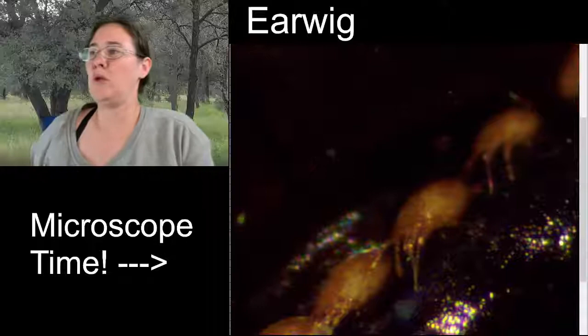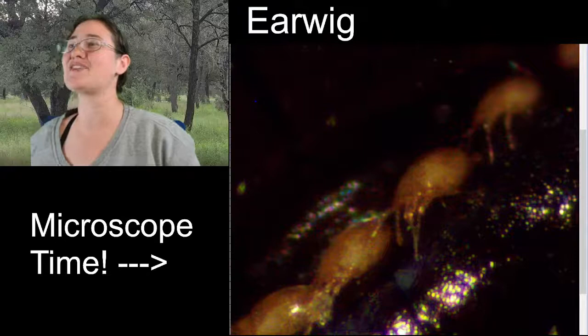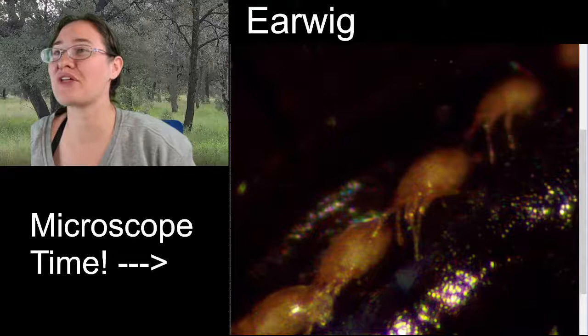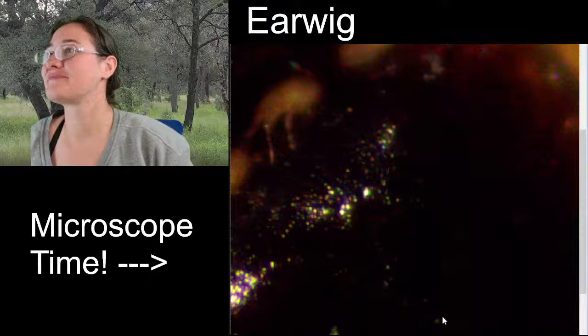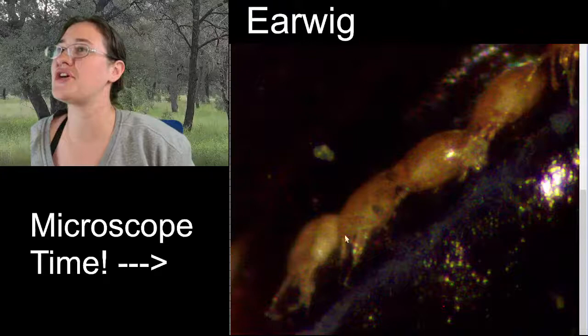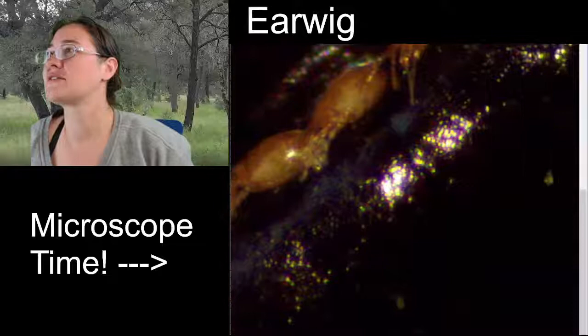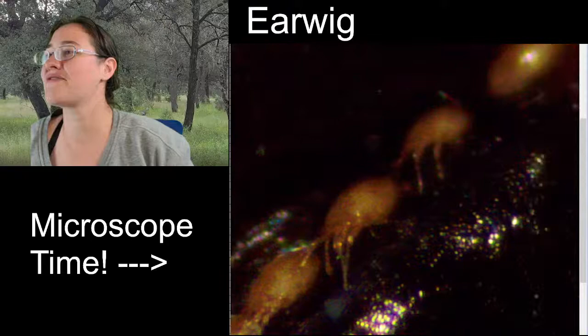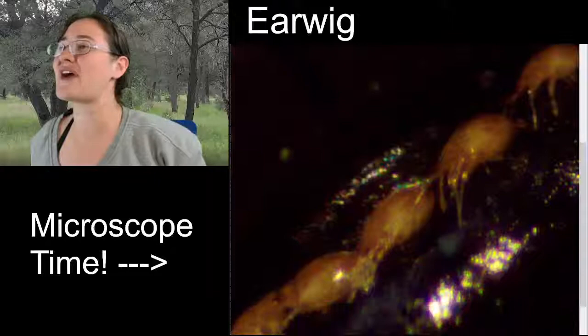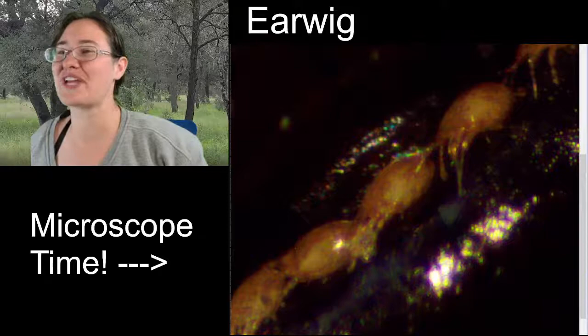So the reason that I can tell that these are mites is because you can see all of those legs. Aww. That would be really cute. Yeah, so I guess we could even count the number of mites. 1, 2, 1, 2, 3, 4. And that is number 7. So it looks like there are 7 phoretic mites on our earwig here. And they look kind of grody. They just kind of look like white blobs with legs.